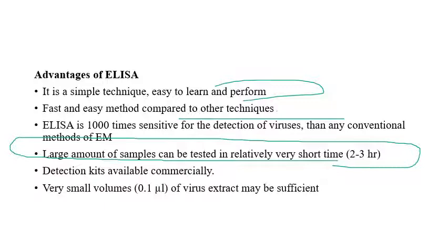Commercial kits are also available, so it is easy to get an ELISA kit. Very small volumes of extract are sufficient. Even a very small volume, 0.1 microliters, is sufficient for performing the ELISA technique.